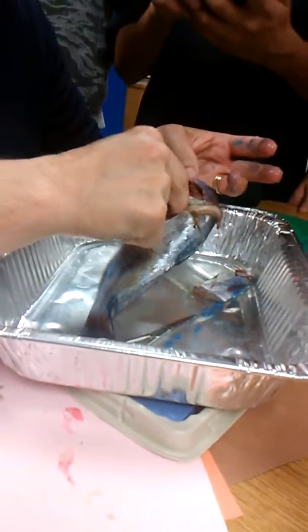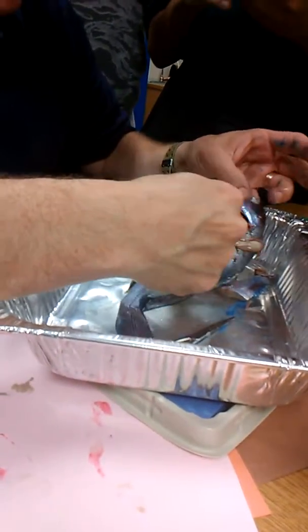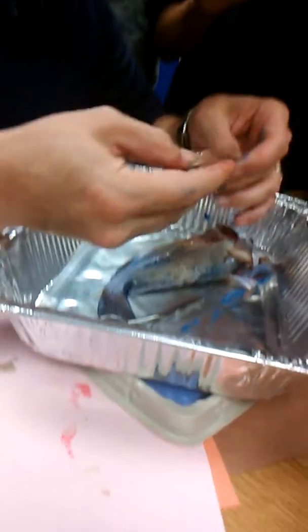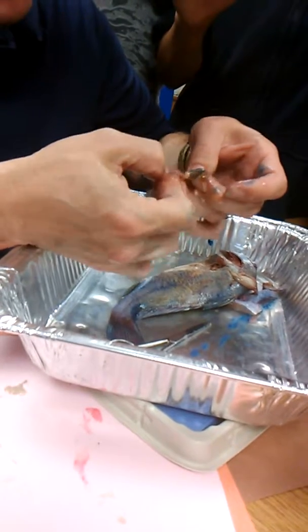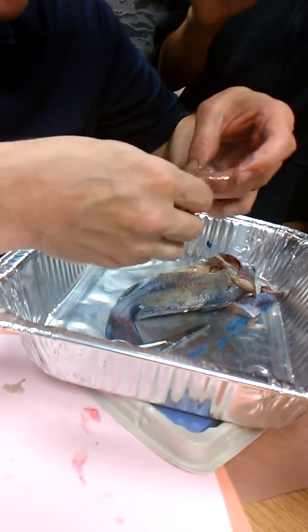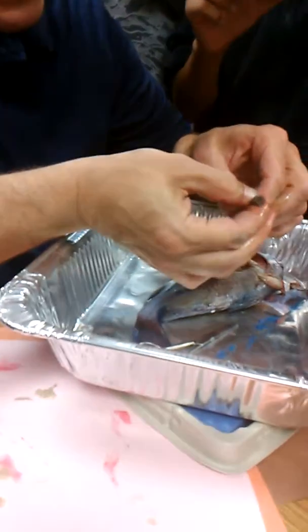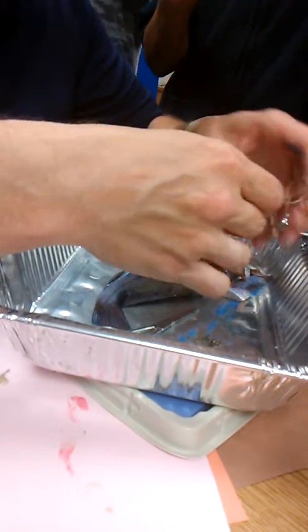I can feel some of the dirt that's in his intestines because he eats off the bottom. Before he was caught on the fishing line, some of it has turned to poop and some of it has not yet been digested. There's a lot of gravel in there — feels like little shells.